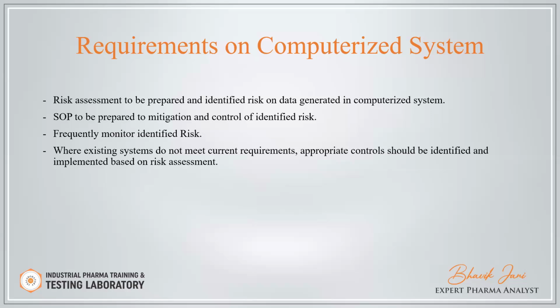Risk assessment is to be prepared, identifying risk on the data generated in the computerized system. You have to prepare the risk assessment and mitigate those risks which are high risk or which are required to be mitigated, and where data changes are there.